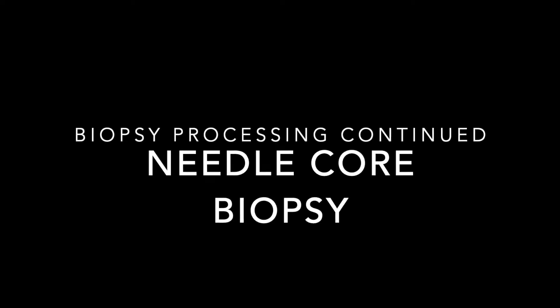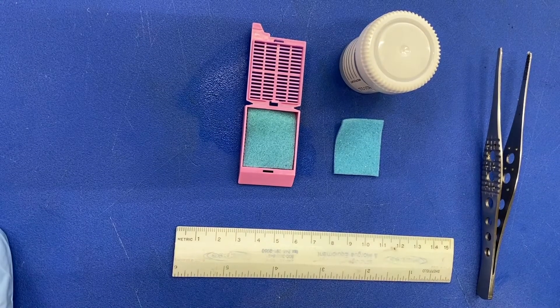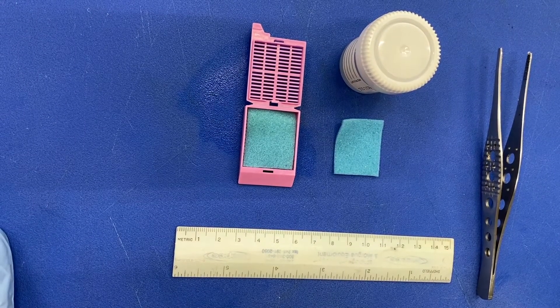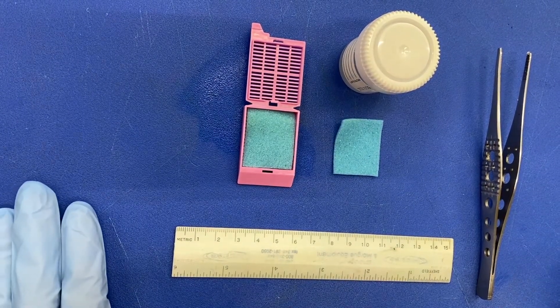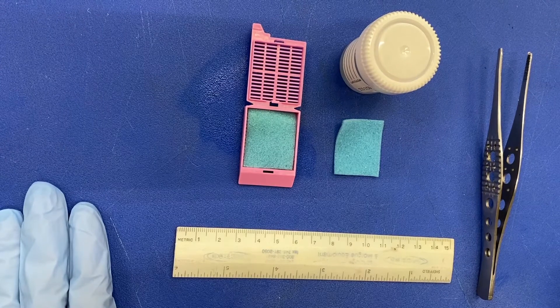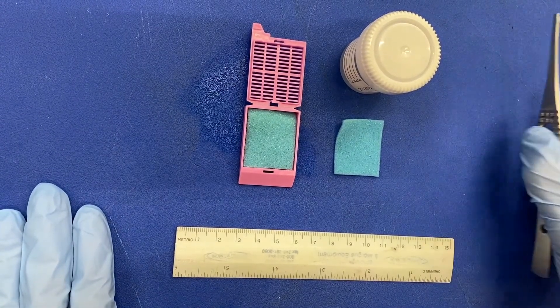The next part of this video covers needle core biopsies. After verifying the patient identifiers on the container, the specimen requisition form, and cassette, you want to make sure you have forceps, a ruler, and biopsy sponges in order to proceed.